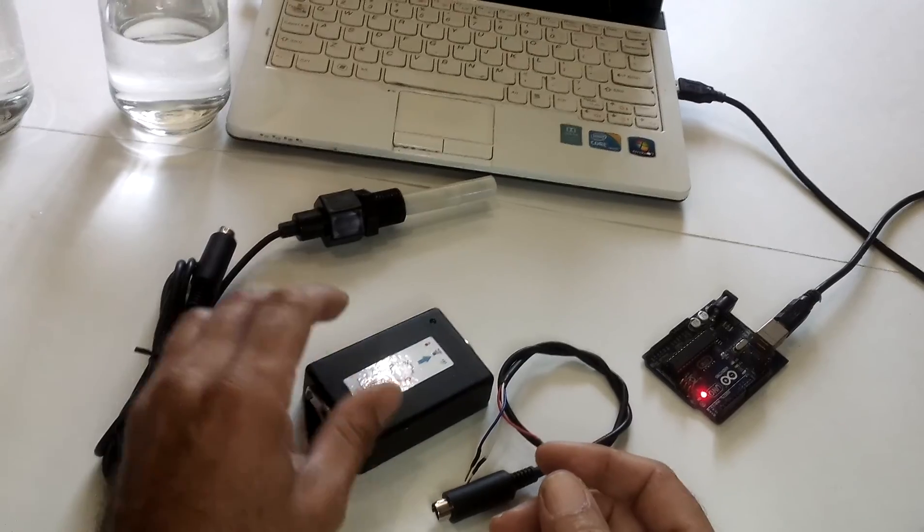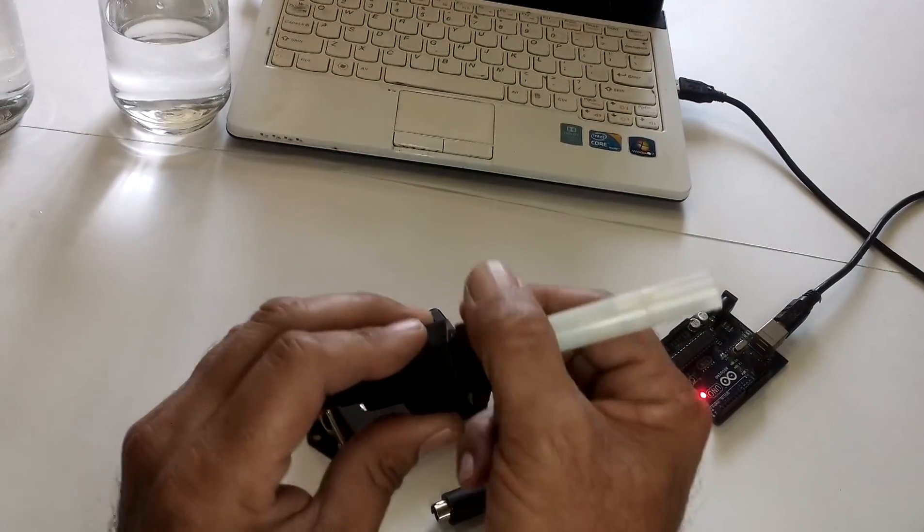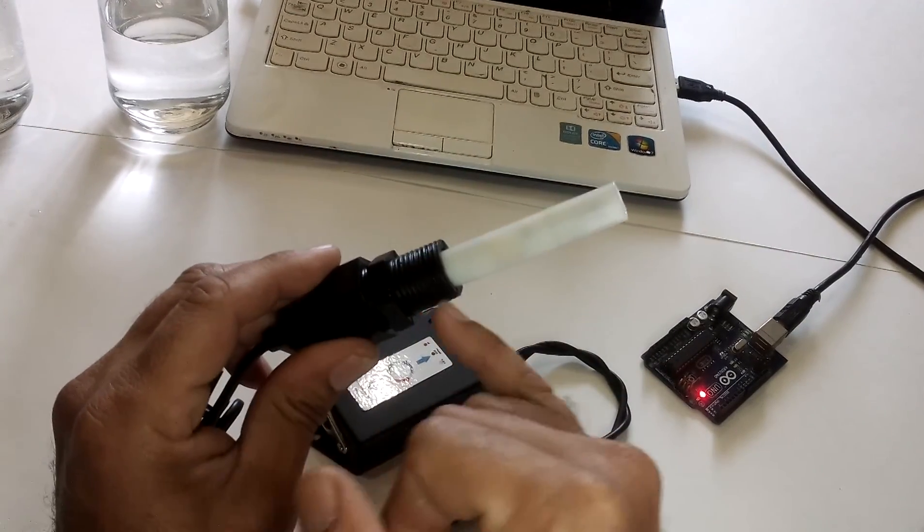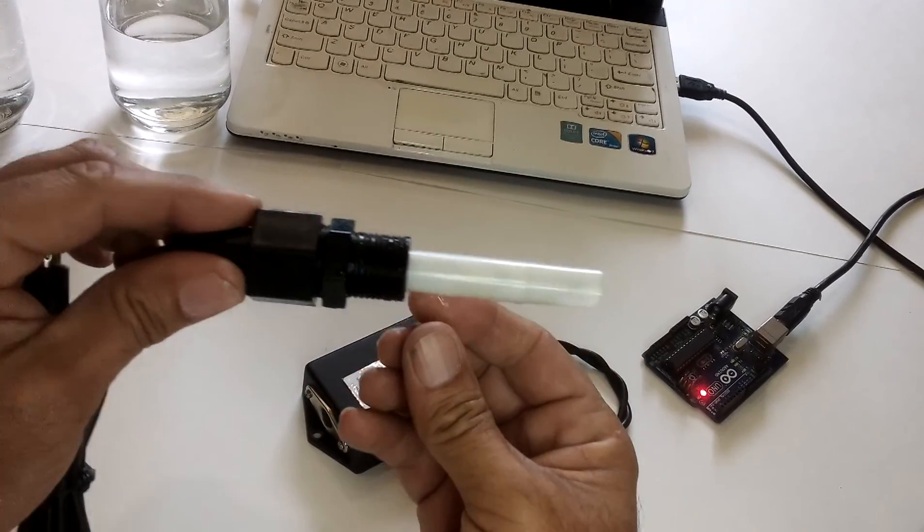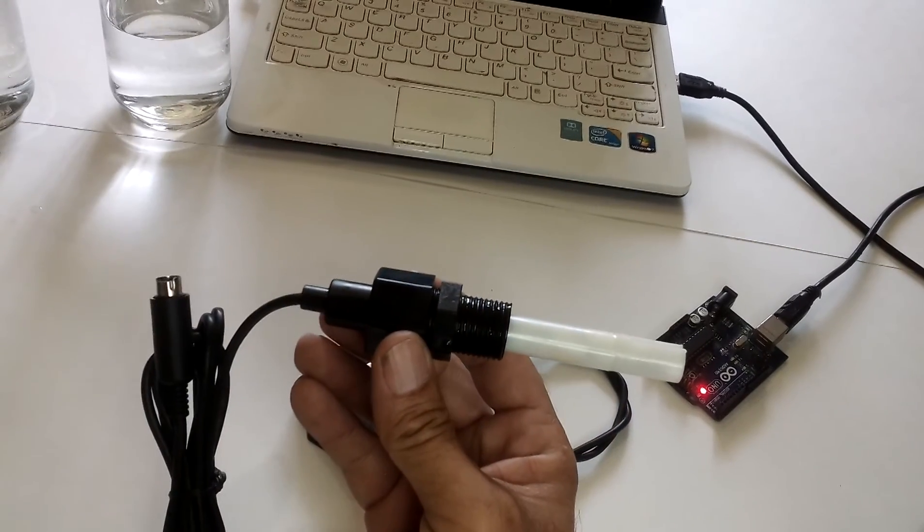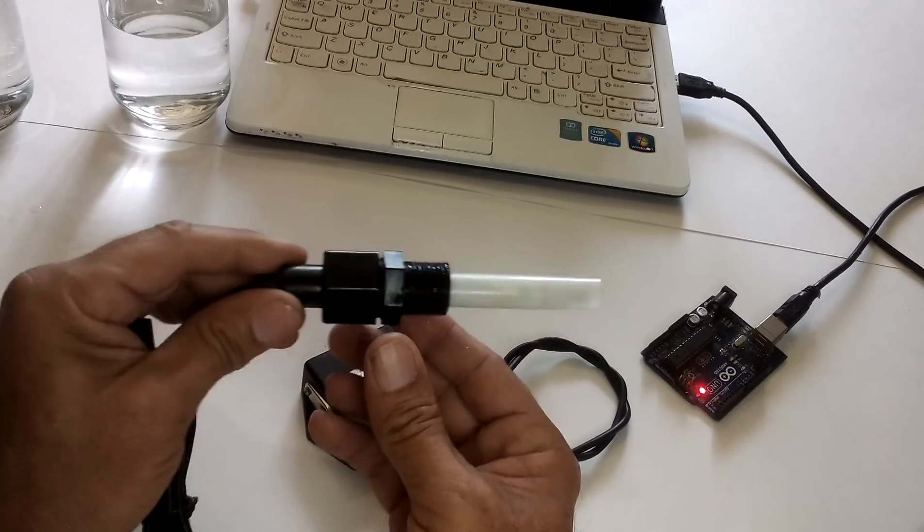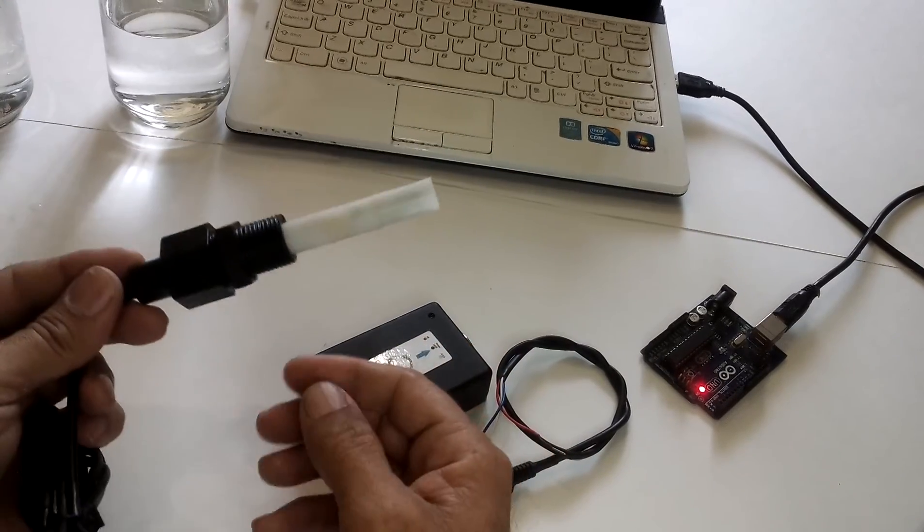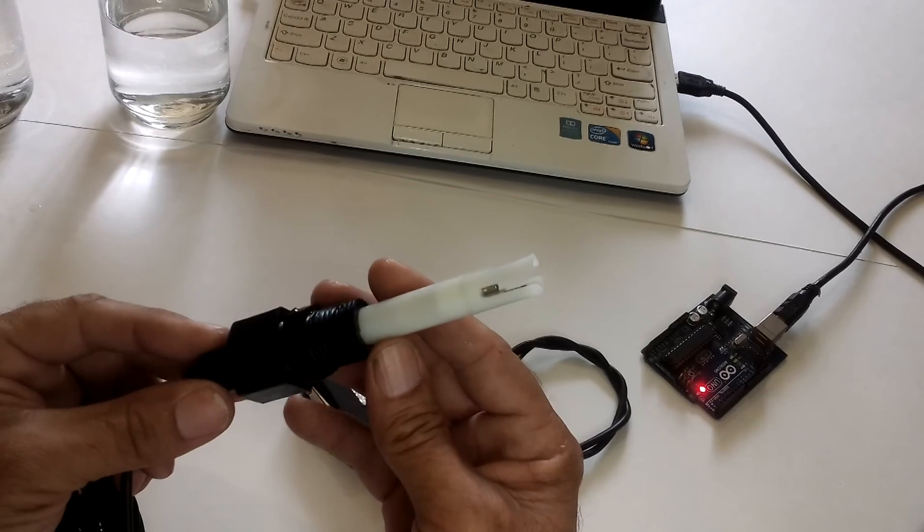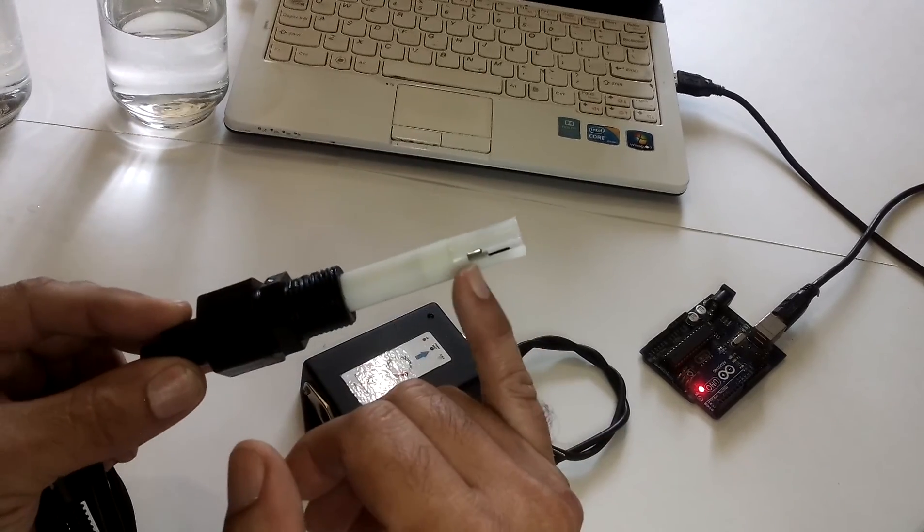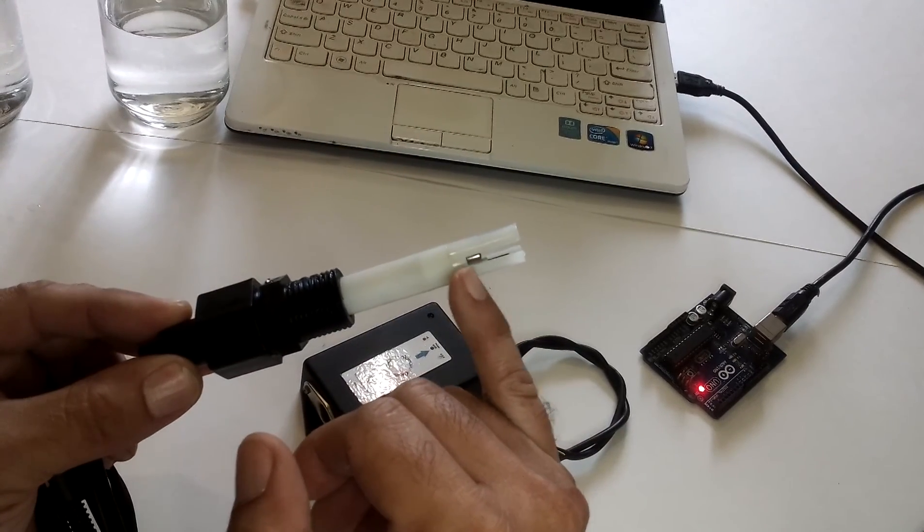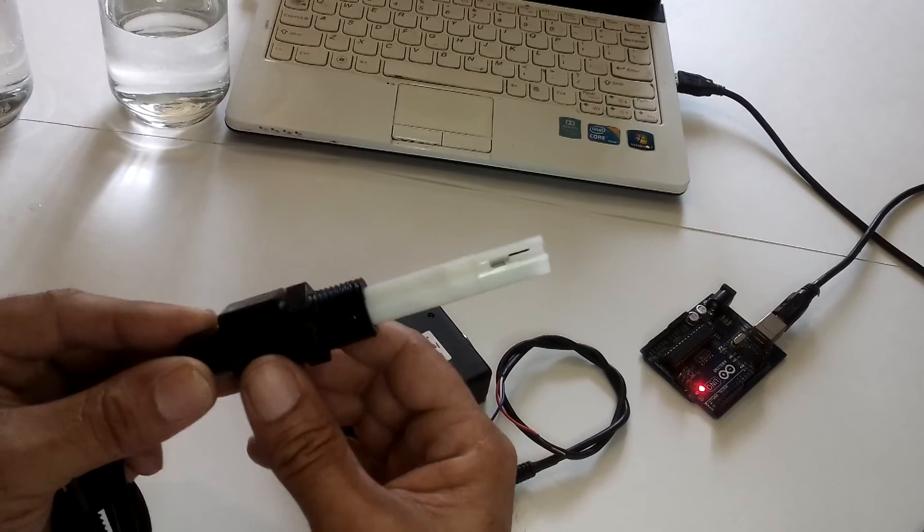The sensor is industrial grade. It does have a half inch threaded fitting. You can actually put this into a T and it becomes an inline probe instead of a submersible or you can submerse it inside the water no problem. It does have a temperature compensator right in the middle. It's a thermistor I believe.